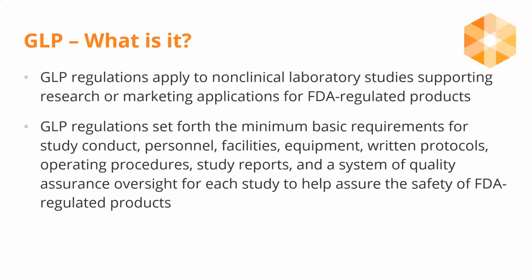As you may know, the GLP regulations address the minimum basic requirements. The regulation applies to all non-clinical laboratory studies supporting research and marketing of FDA-regulated products.